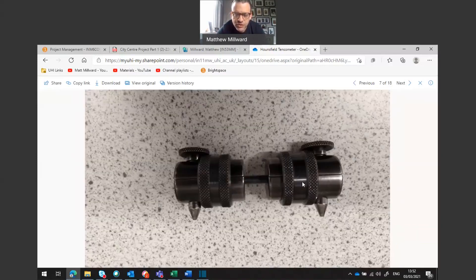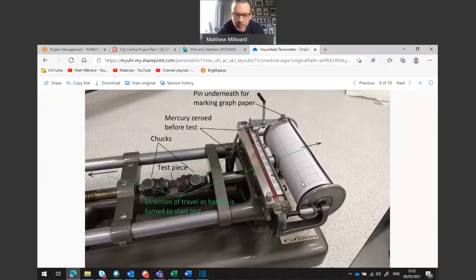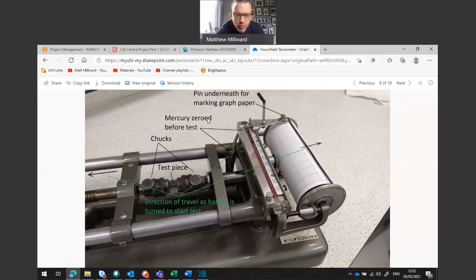Here's a zoomed in look at the actual machine. The test piece is put in and the two pins — or chucks, for a more technical term — will attach it to the Hounsfield tensometer machine. The mercury will be zeroed at the start of the test and then we have the graph paper which revolves around this drum where we will mark the graph on.